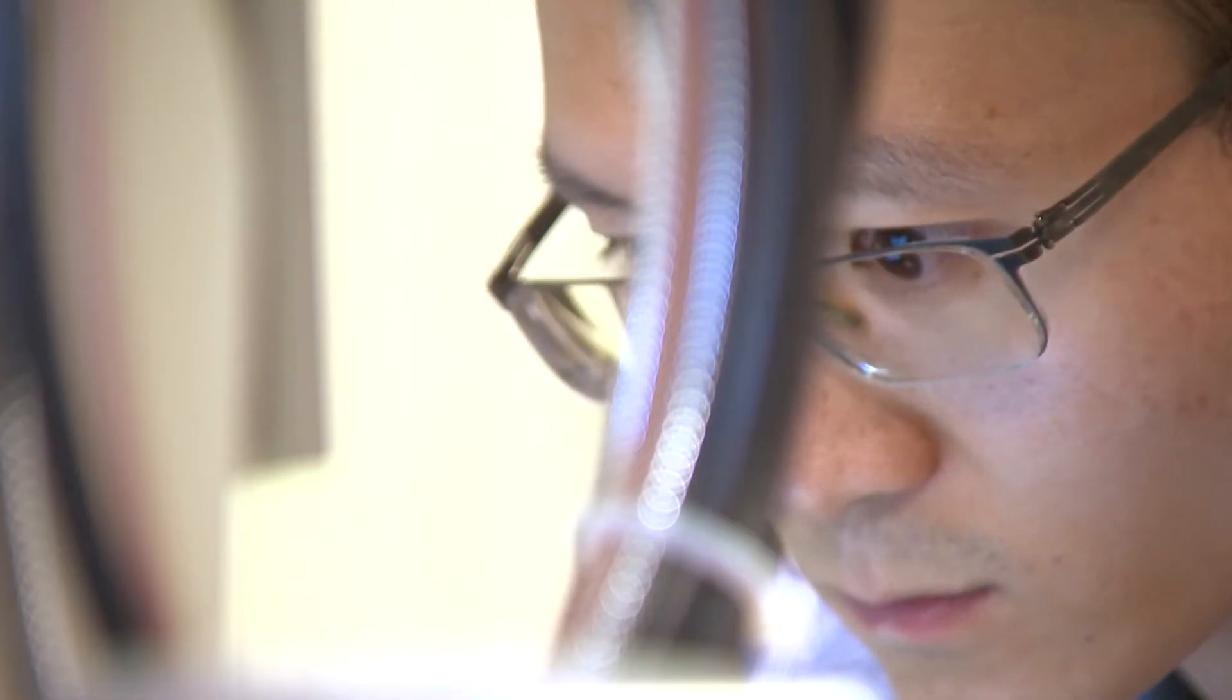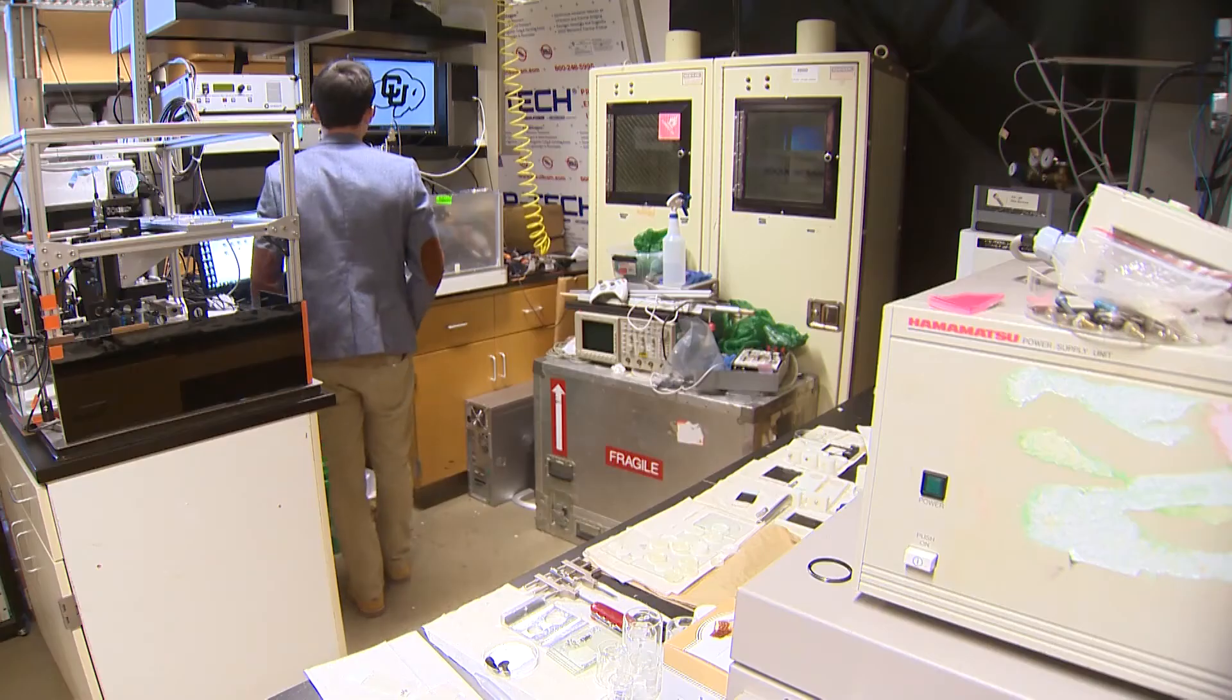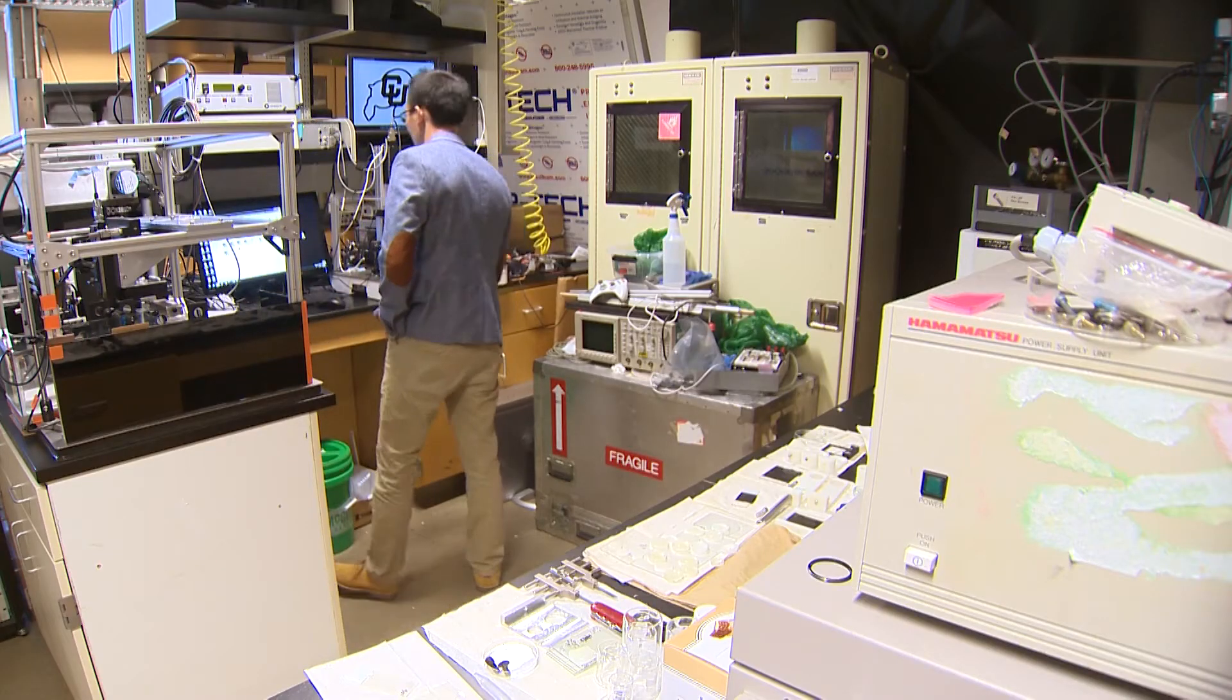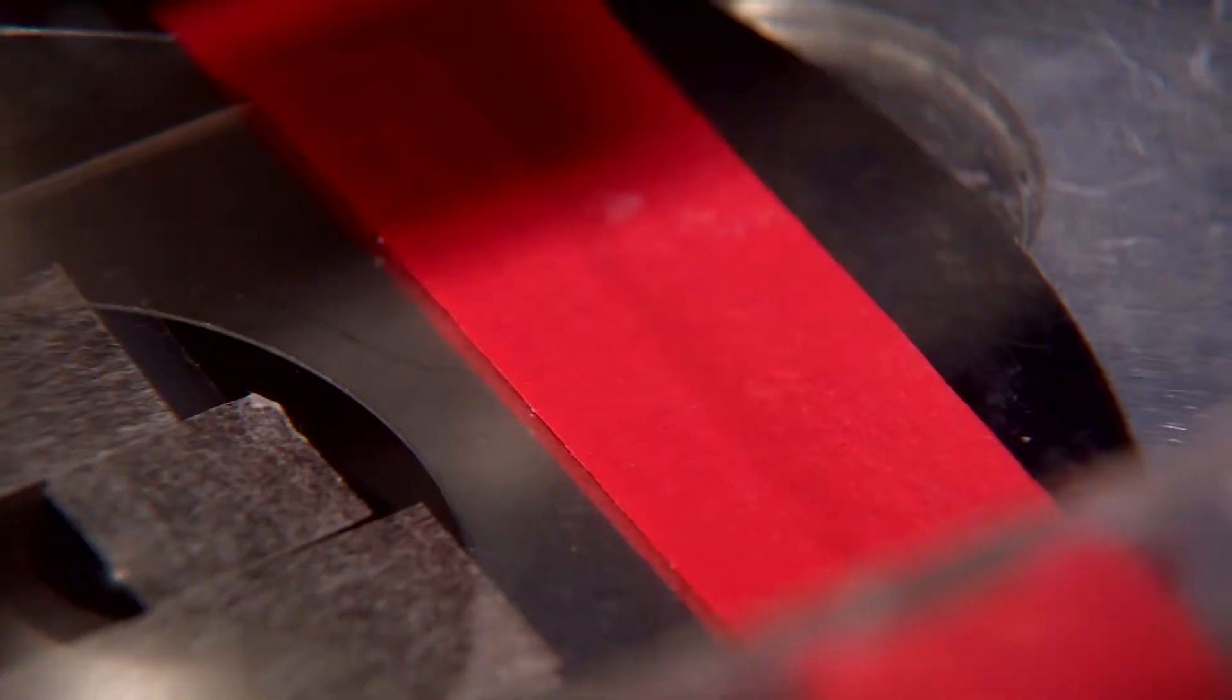Yonghui Ding is a post-doc biomedical engineer at CU Boulder. He and two partners spent a couple years developing a cutting-edge 3D printer.